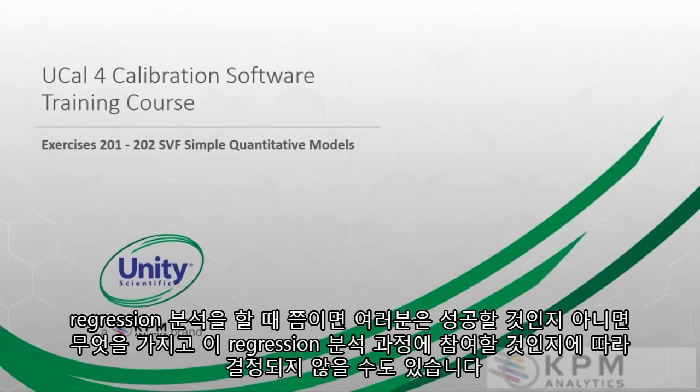Just like to say, again, by the time you've gotten to this step, your fate is really sealed. By the time you're doing a regression, you're either going to be successful or not based on what you're going to take into this regression process.